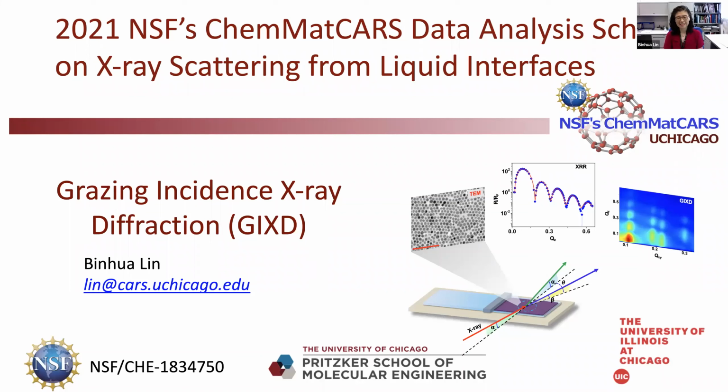Welcome back. It's the second day of our school, as we mentioned, and I'm going to talk about grazing incident X-ray diffraction. I would just call it GID. The plan for this lecture is that we split into two parts. The first part will talk about 30 minutes, and then we'll leave you 15 minutes for assignment 1. And then after a break, I will talk for another 30 minutes, and then Wei is going to take over for your assignment 2.